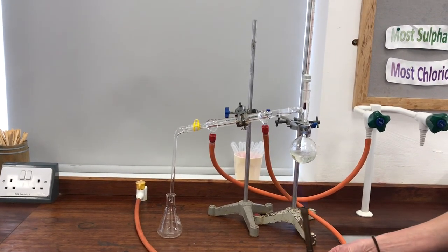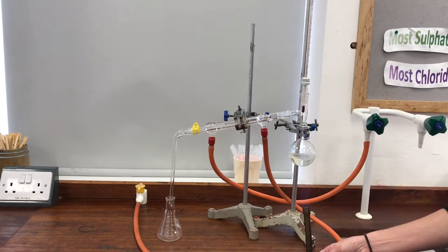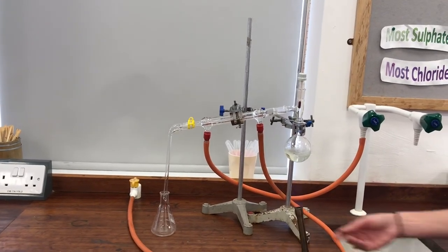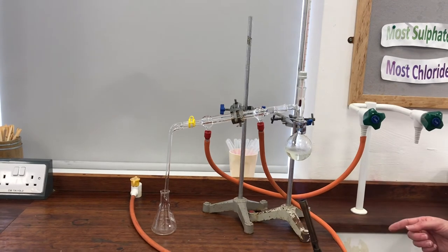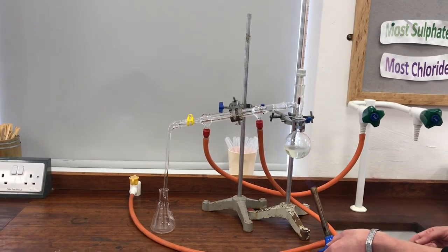Now if you look over at the flask at the other end here, you can see that there are drips of ethanol coming out of it, and we call that substance that we collect there the distillate. So it's the product of distillation.